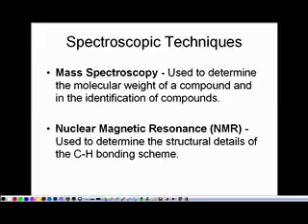Well, the mass spectrometer can actually be used to identify the structures of molecules. And we'll talk about how that's done. And so that part is real. A lot of the other stuff, the time it takes, is not real on TV, and they take liberties with how easy it is to get structures. But we'll talk about mass spectrometry.